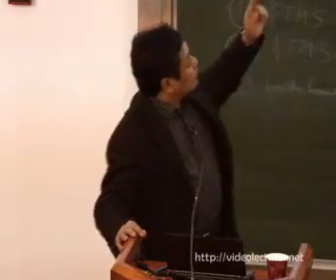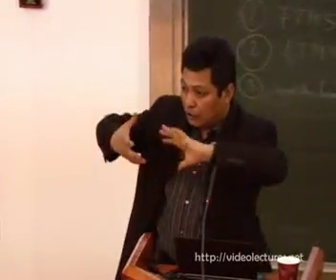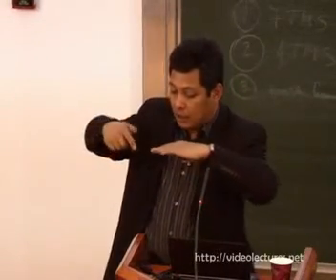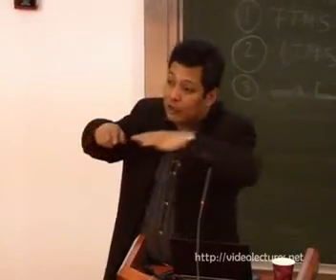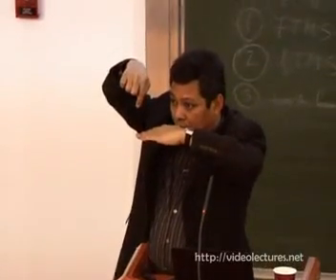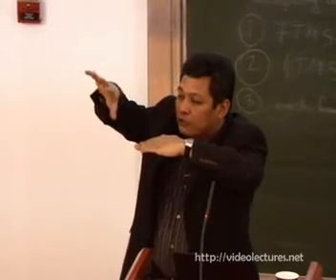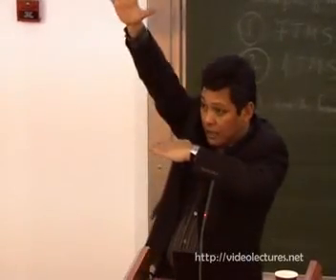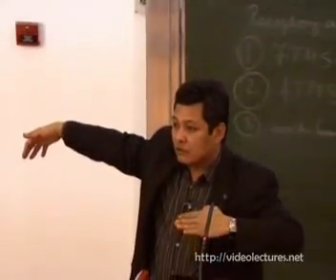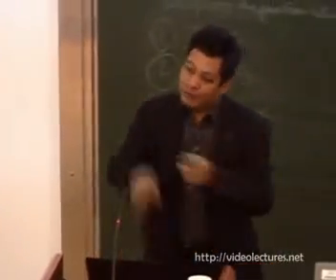In principle, it should not have any distinction between left and right because the molecule and the substrate don't have any direction. The only reason it's moving forward is that the potential energy is lower under the tip. So it always ends up forward? Yes, because of the presence of the tip. Suppose you excite this with laser light without the tip, then the molecule should move in both directions, left or right. It should have no memory of left or right. Now it has a memory because of the tip.